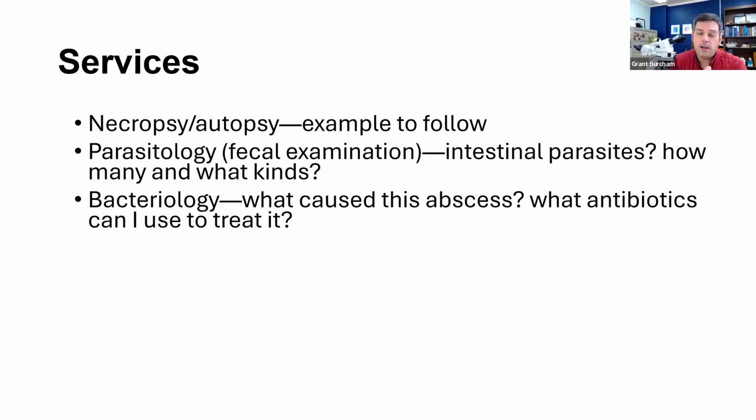So I'm not going to talk about autopsy or animal autopsy. We're going to go through a case actually later in the presentation to illustrate what that's like. But we also do parasitology, so fecal examination. Do my animals have intestinal parasites? How many and what kinds? We can tell you that.